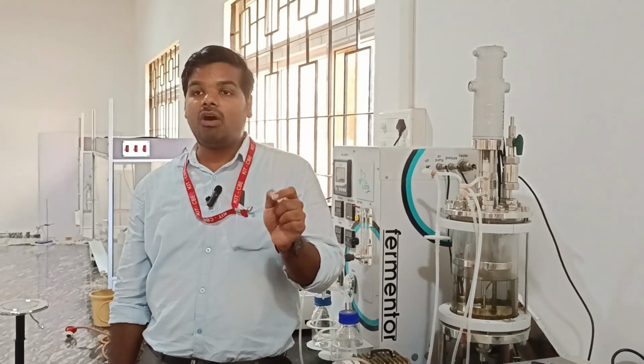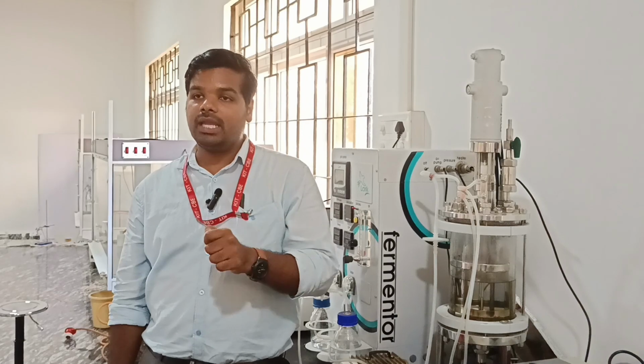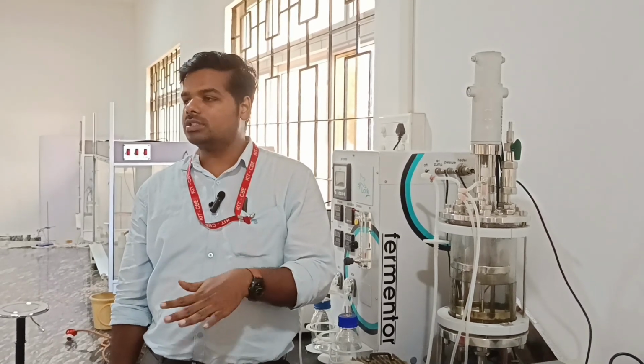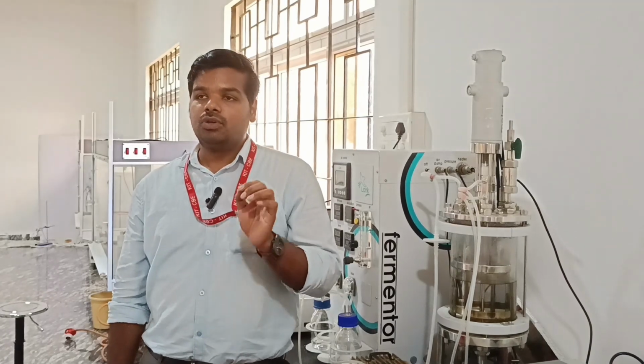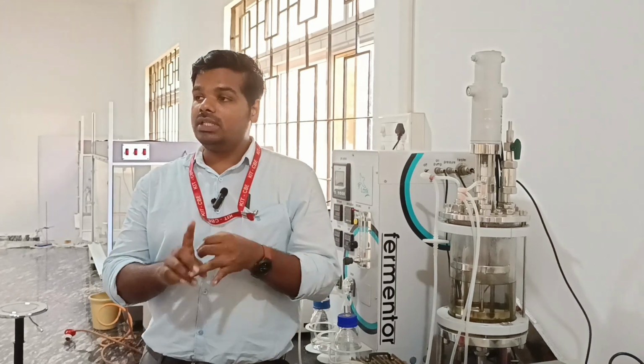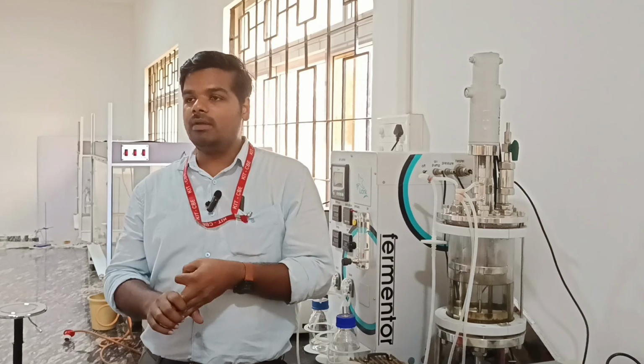Using this, del overall is now calculated. So del overall is ln N0 by Nt. In our case it will come to around 32.2 or something like that. This is the overall del factor which is achieved through these three stages. What are those three stages? Heating period, holding period, and cooling period.